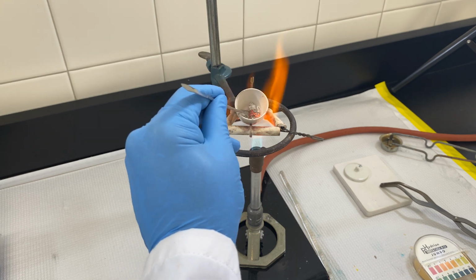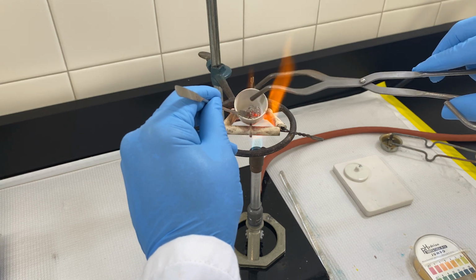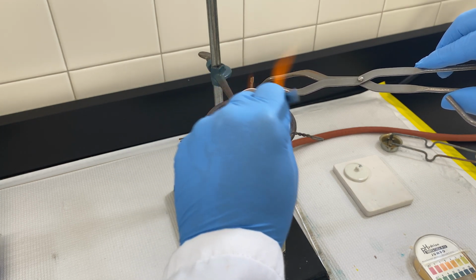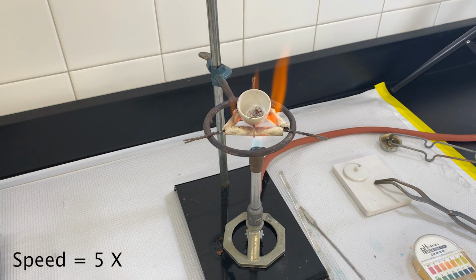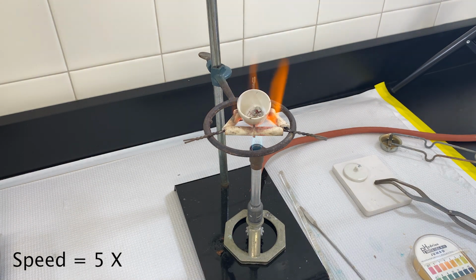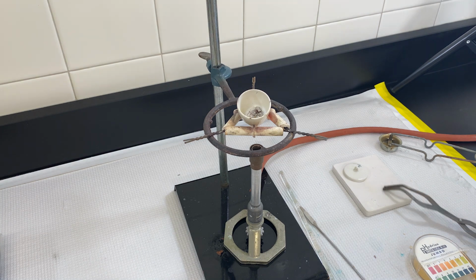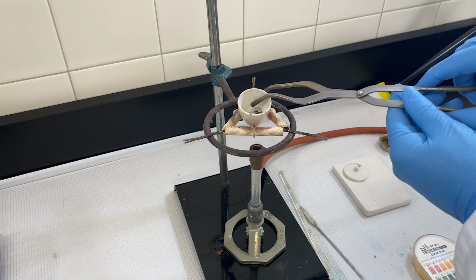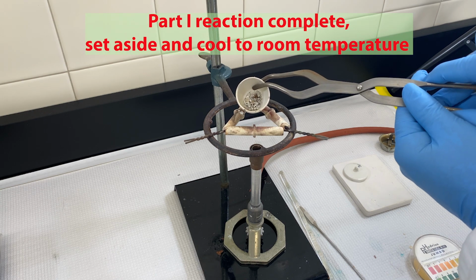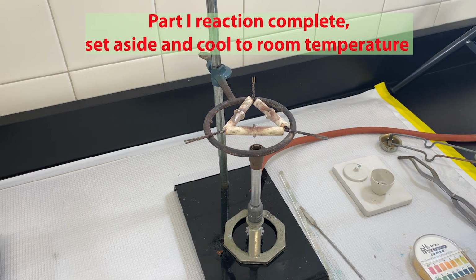The starting magnesium metal was a very dark gray. The product, magnesium oxide, is a very light gray to whitish solid material. That looks pretty good. Let's set it aside, let it cool to room temperature, and then proceed to part 2.